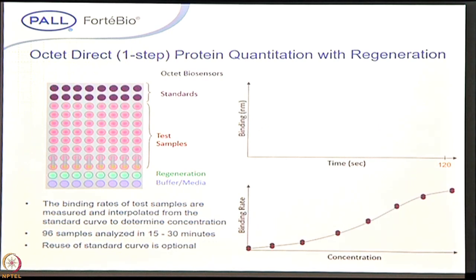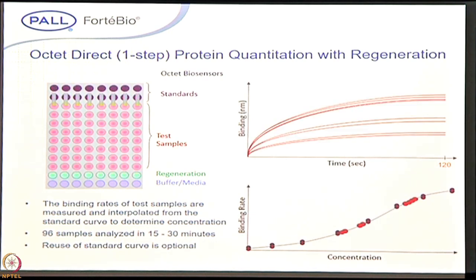Then when it dips into the unknown solutions, where your protein is expressed, you can easily quantitate using this plot. So it is a very quick experiment. In 15 minutes, you can determine the concentration of your protein of interest.